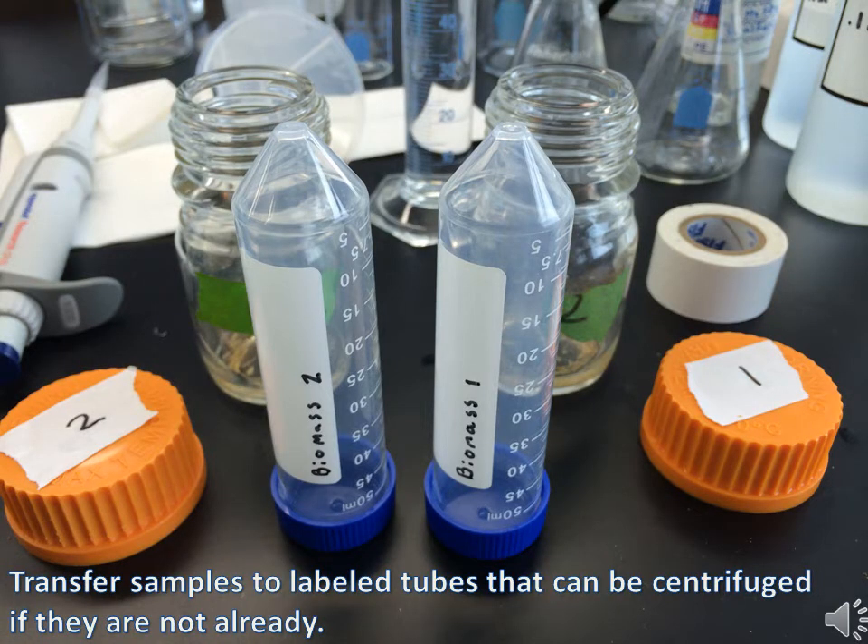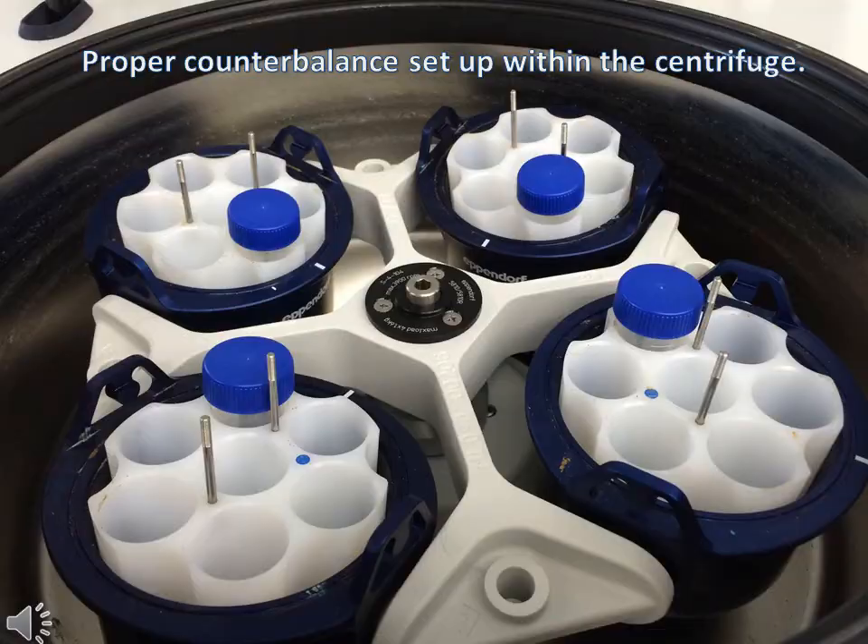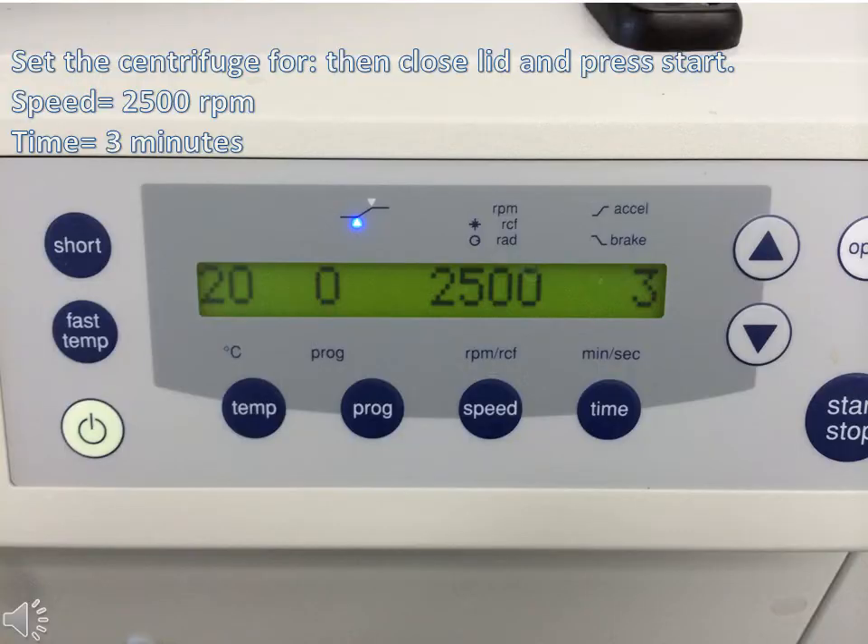Transfer the samples to labeled tubes that can be centrifuged. In order to counterbalance the centrifuge properly, weigh out each sample test tube and create a counterbalance tube by filling it with DI water to the nearest 0.1 gram. Place the test tubes in each slot symmetrically so that the centrifuge remains counterbalanced. Set the centrifuge speed to 2500 rpms and the time to 3 minutes, then close the lid and press start.